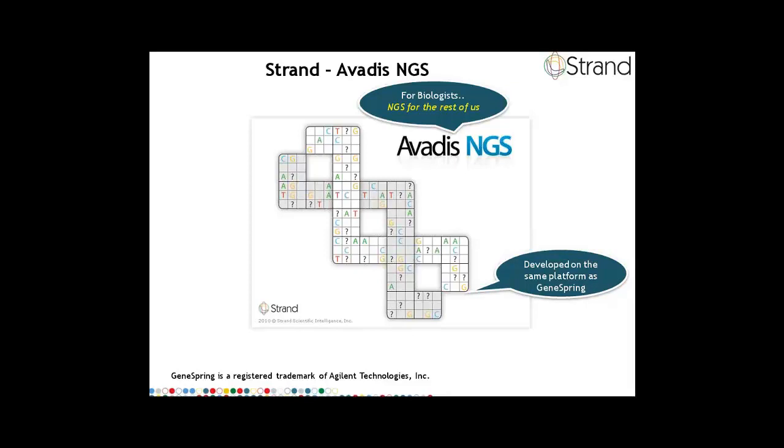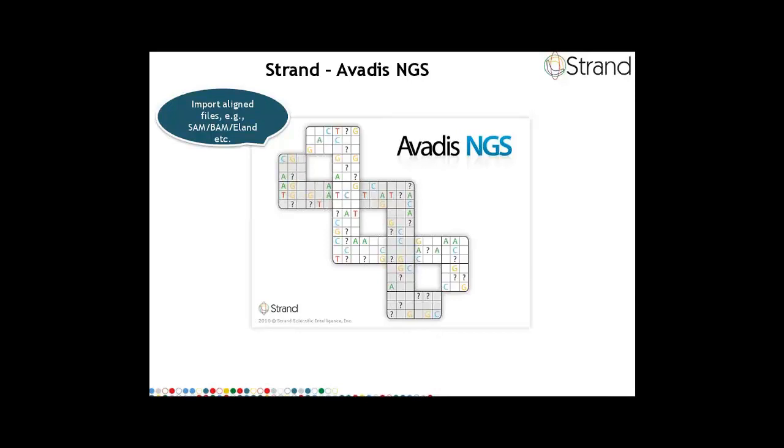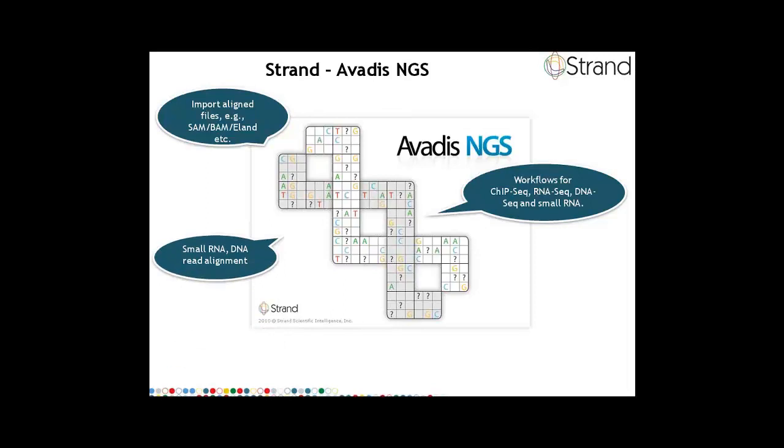Avadis NGS, right from the first edition, supported import of aligned files which were in SAM, BAM or Illumina-specific ELAND formats. The first version of the product had workflows for ChIP-seq analysis, RNA-Seq analysis and DNA-Seq analysis. Small RNA analysis was added one release later. In addition, we also provided alignment support for small RNA reads and DNA reads.